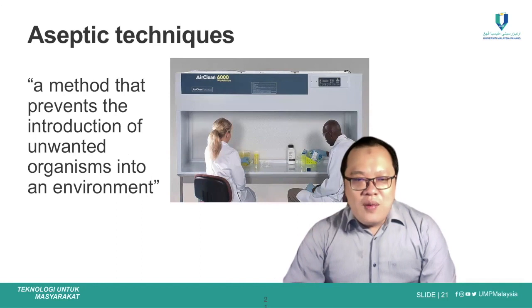We want to perform the aseptic technique to isolate or to manipulate the specific bacteria or fungi that we want to culture only in the culture media.